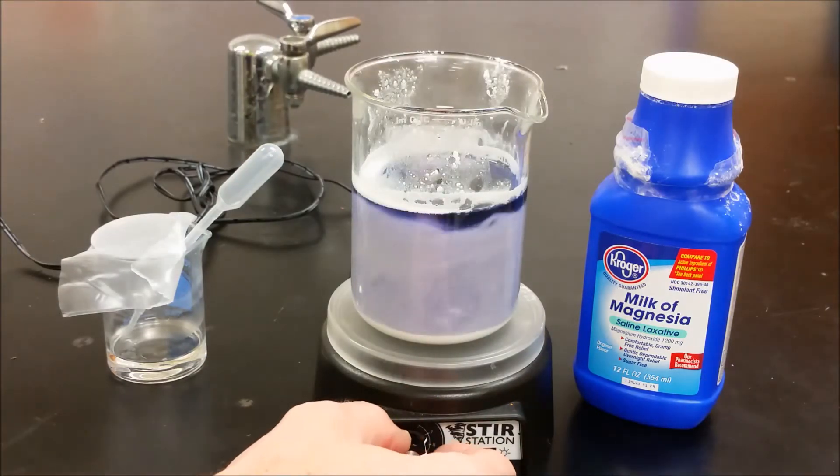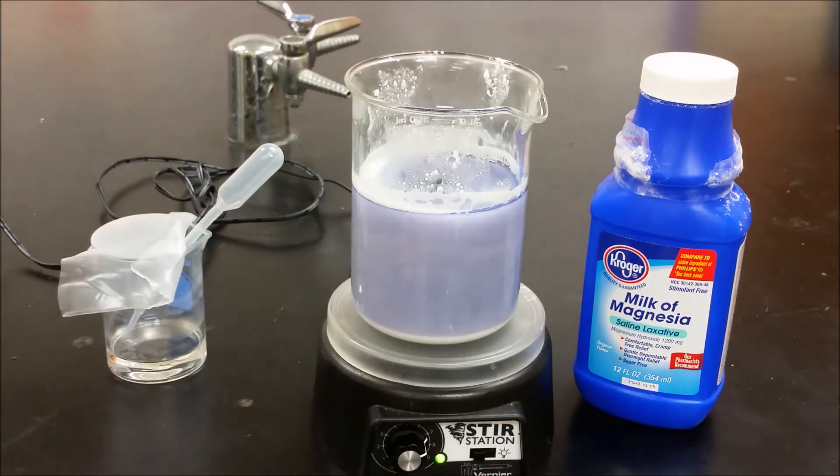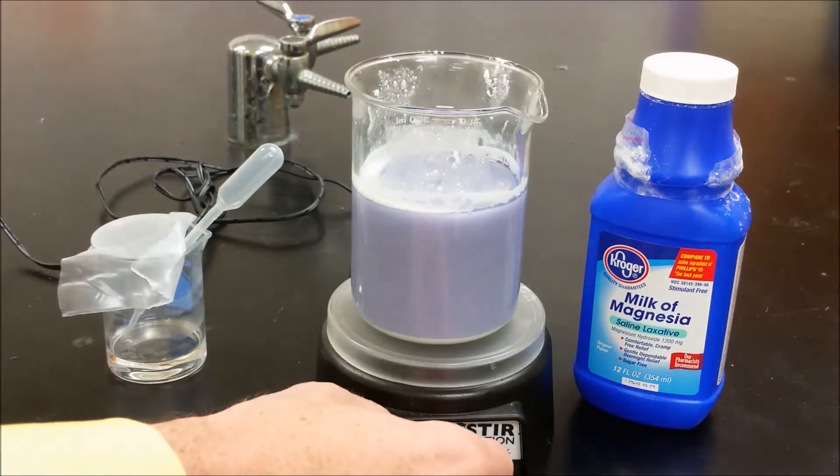Milk of magnesia is magnesium hydroxide, which is basic, so we see this purple color from the Universal Indicator. It's also insoluble in water, so only a really tiny amount is actually dissolved at this point.